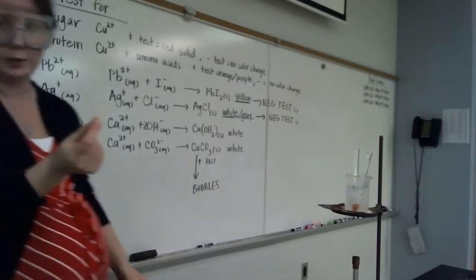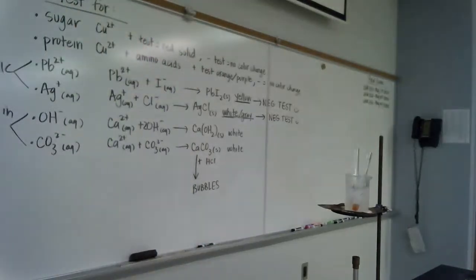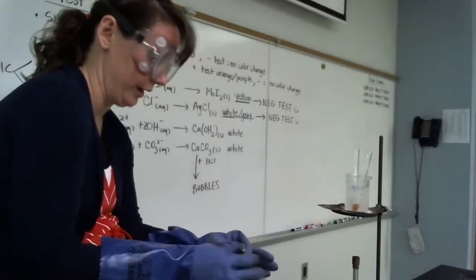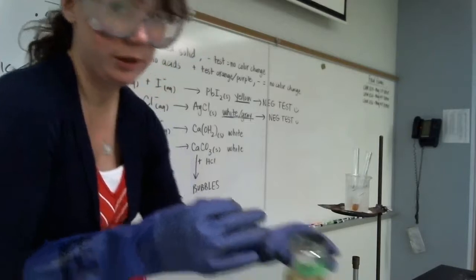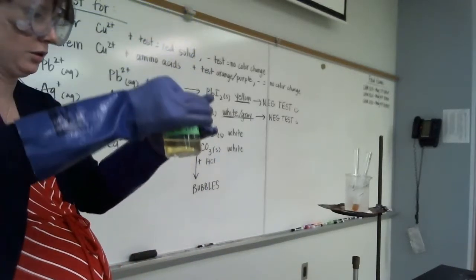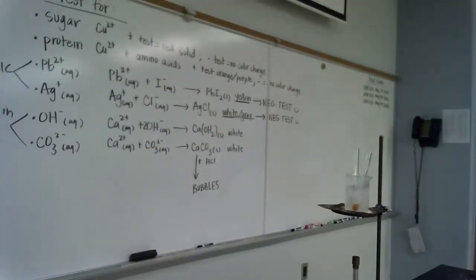All right, so pH paper here. Let's get my gloves back on. This will tell us, is there a lot of hydroxide in this water or not? So we're going to take our sample, measure its pH. Let me get my indicator.